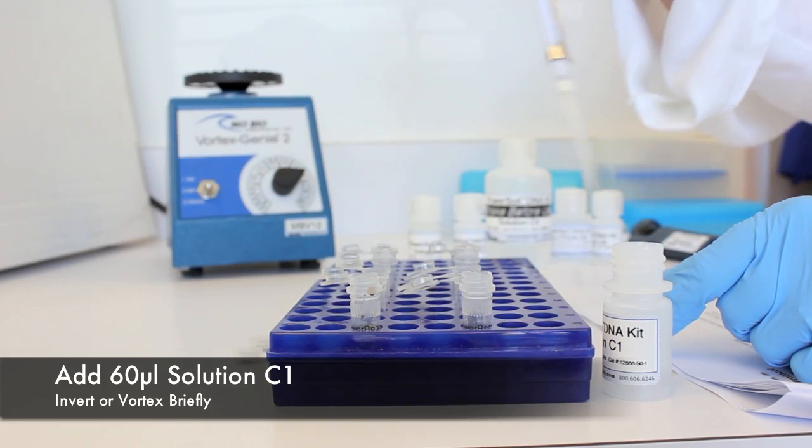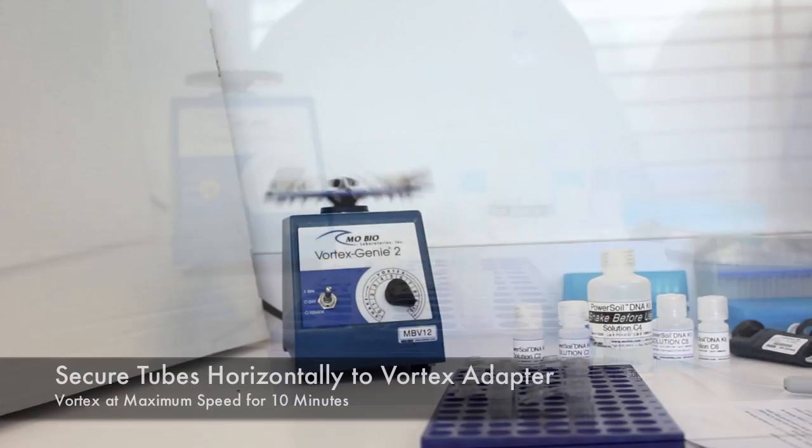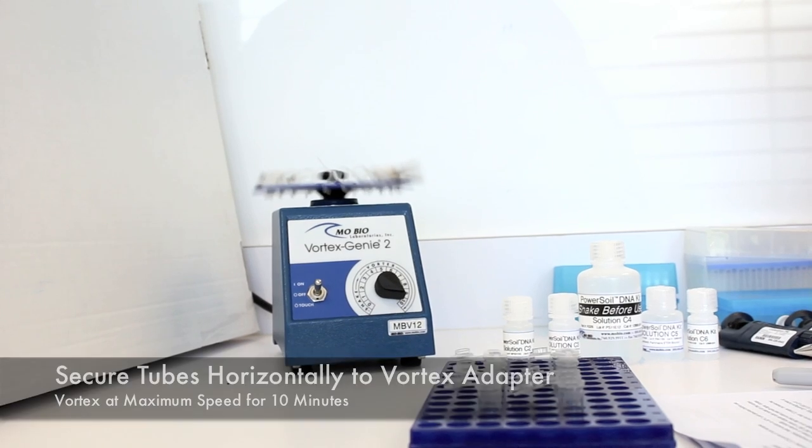Add 60 microliters of solution C1 to the tube and invert several times or vortex briefly to mix. Vortex at max speed for 10 minutes.